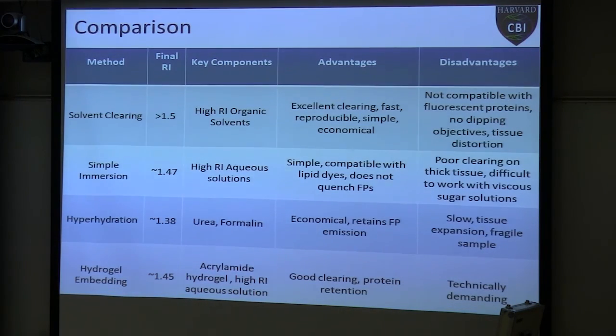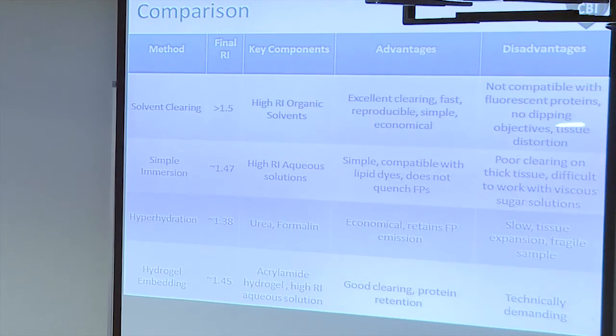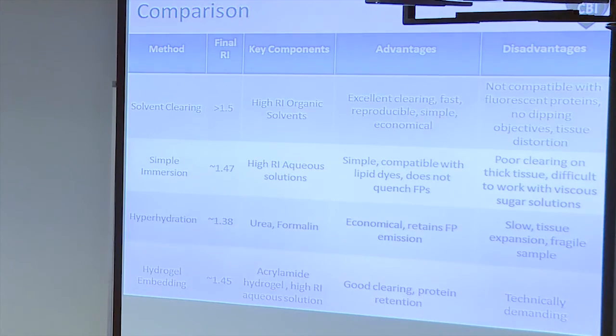It's also not compatible with dipping objectives. So if you put a microscope objective into these solvents, you're going to destroy it. And finally, there is often a lot of tissue distortion. There's a lot of shrinkage with these techniques, which I think is something that's going to be addressed with iDISCO+ and uDISCO.